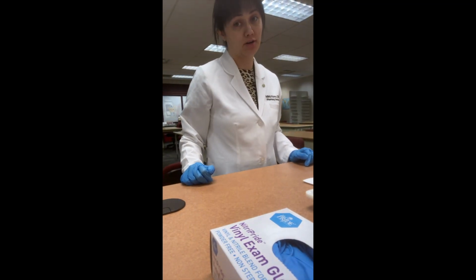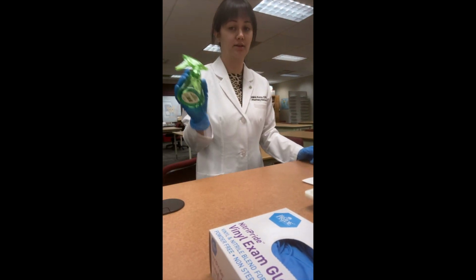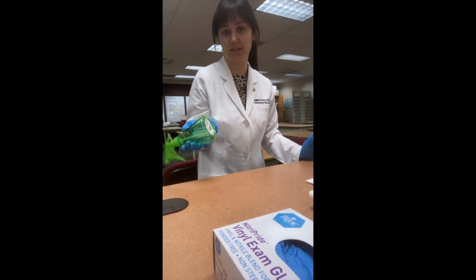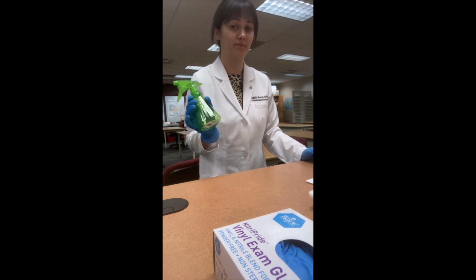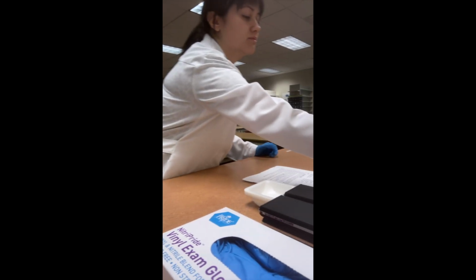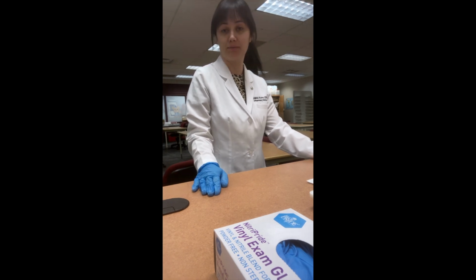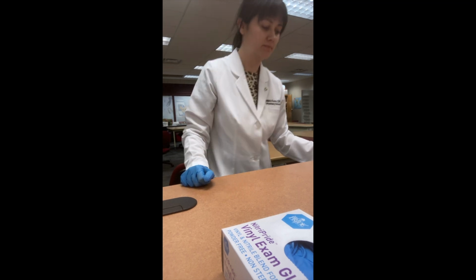Next, you want to make sure your work surface is always clean. We can do that with 70% isopropyl alcohol, which is what you always use to clean pretty much anything in any kind of pharmacy environment. If you're doing sterile compounding, you'd use sterile isopropyl alcohol, but here you would just use regular isopropyl alcohol. So make sure your work surface is clean, and any devices or ointment slabs that you're using are clean prior to working.